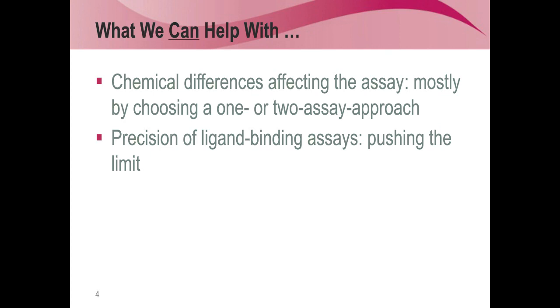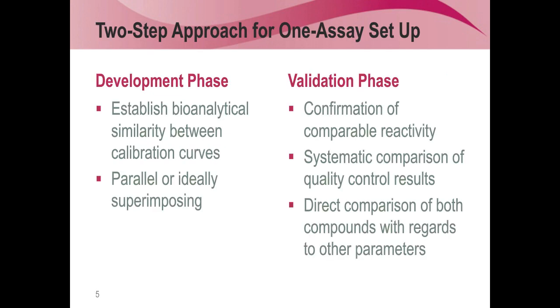And also, of course, with the precision of the ligand binding assay. There are some little things I will show you later, where we can really push the performance of the assay. And we have developed a 2-stage process on setting up assays in the analytical laboratory. And for most of the cases, this is a single assay. So that is nothing really new.